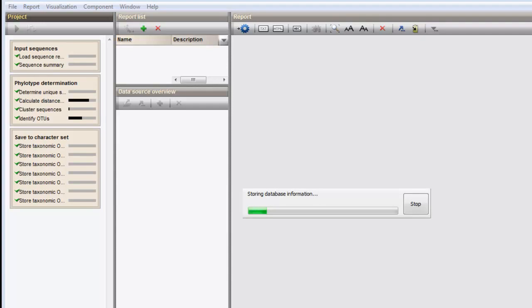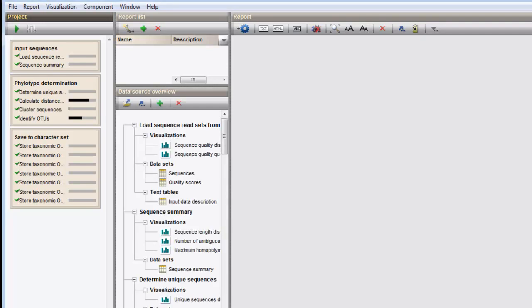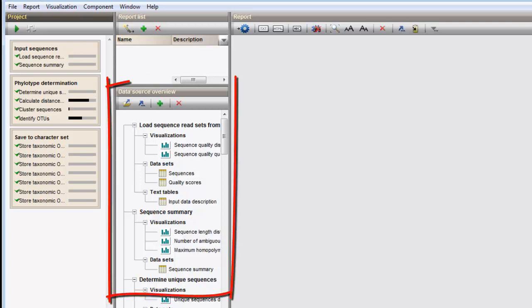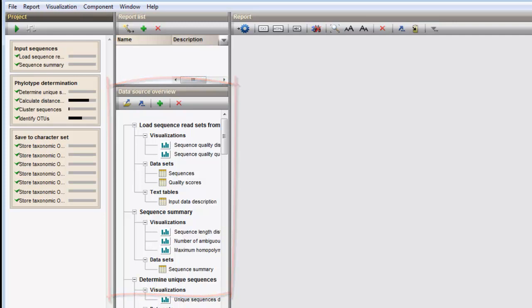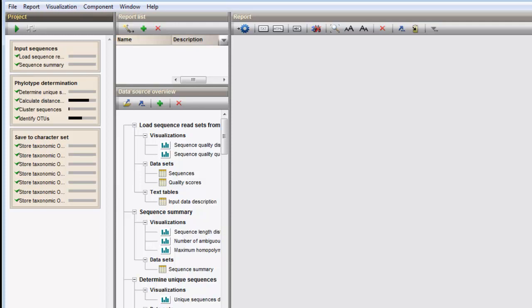Once the project calculation has finished, an overview of the generated results, which are a range of different visualizations, datasets and text tables, is present in the data source overview panel. With these data sources, a number of predefined reports can be generated. To create a report from one of the templates, click the Add report from template button. Depending on the available data sources, different templates become available and are listed in the Create report dialog.